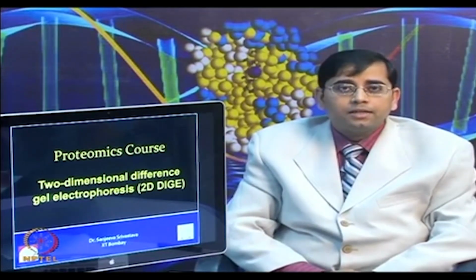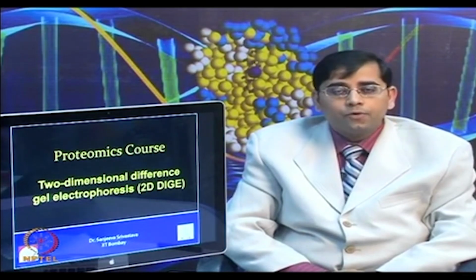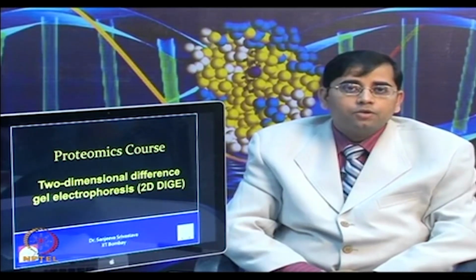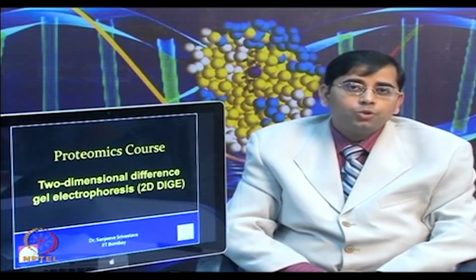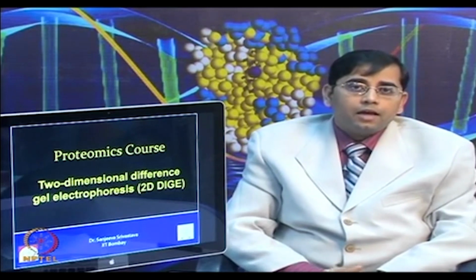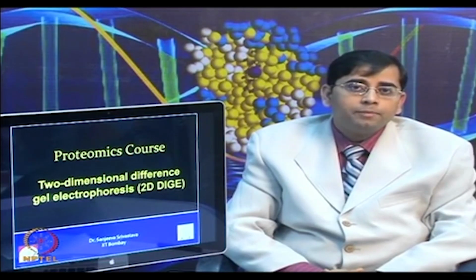We discussed protein extraction, isoelectric focusing, equilibration, and second dimension separation by using SDS-PAGE. Finally, we talked about different types of staining methods which are available and how to scan and analyze those images. We then further talked about different advanced methods which are creative ways of overcoming limitations of gel based approaches.